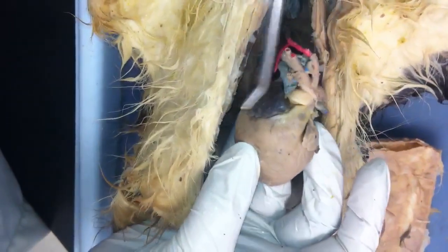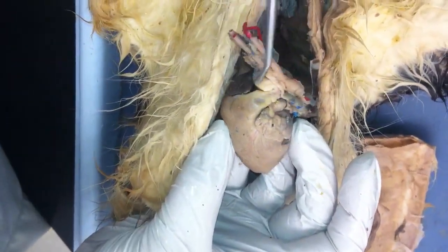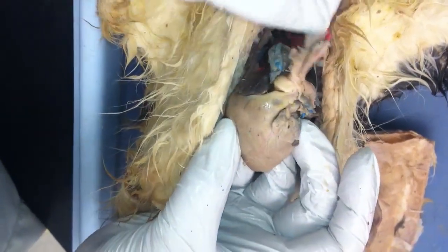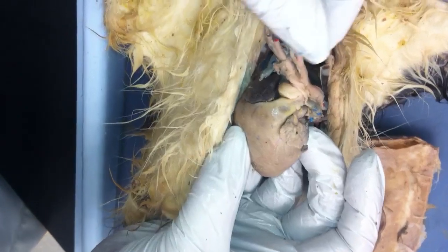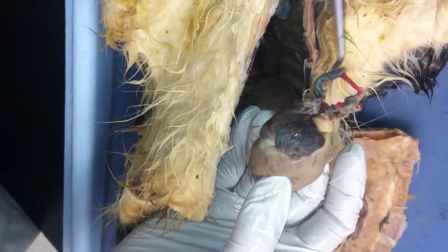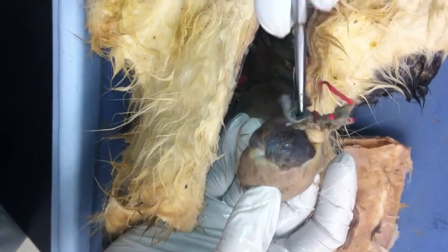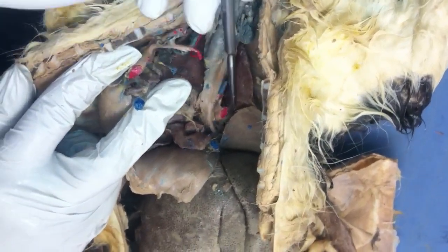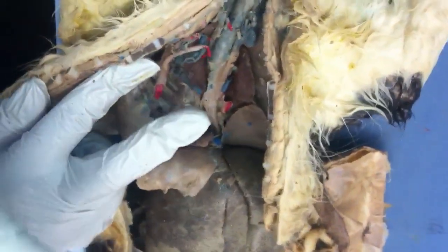And then at the heart, we've got right side, left side. So the aortic arch is this right here, it's arching around. The first branch is the right brachiocephalic artery, then the left subclavian artery, and then there's the blue going back into the heart, this is superior vena cava, and there's inferior vena cava. And then from that point, where we cut it, that would be descending aorta, which goes through the diaphragm and all the way behind the intestines.